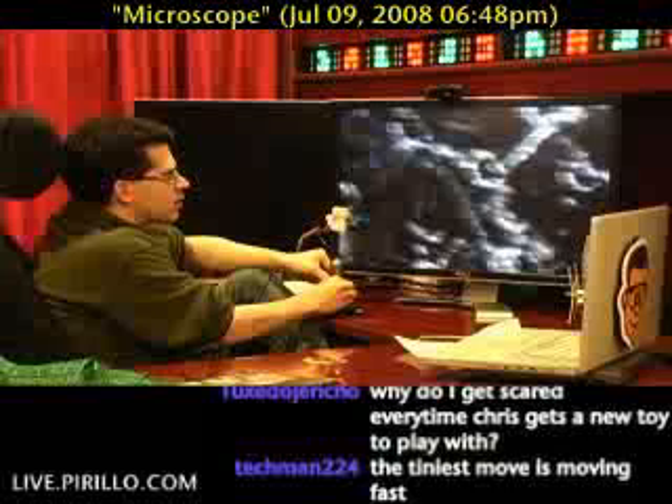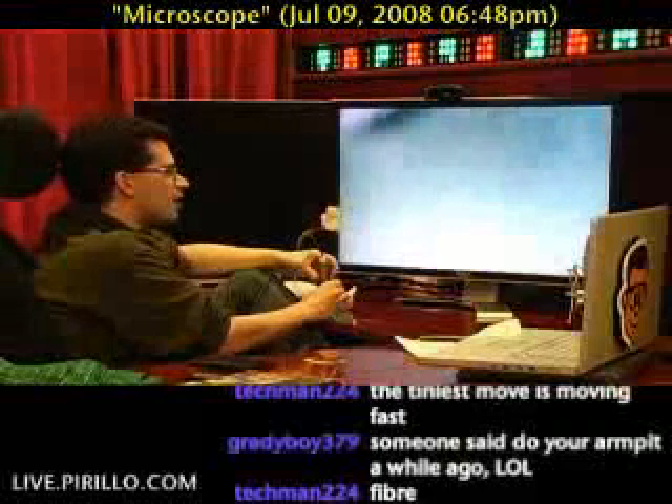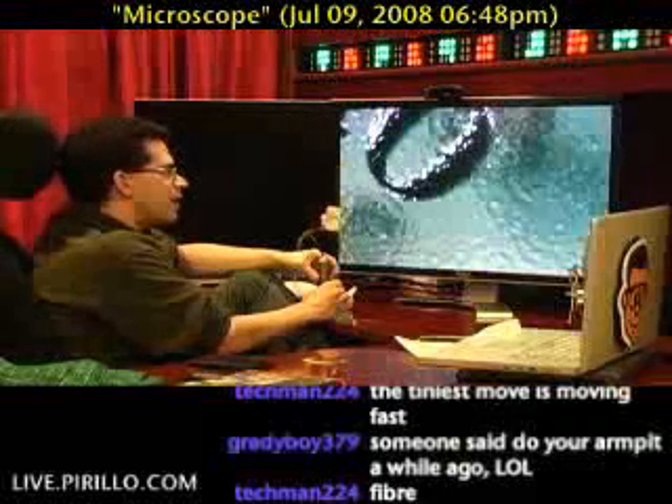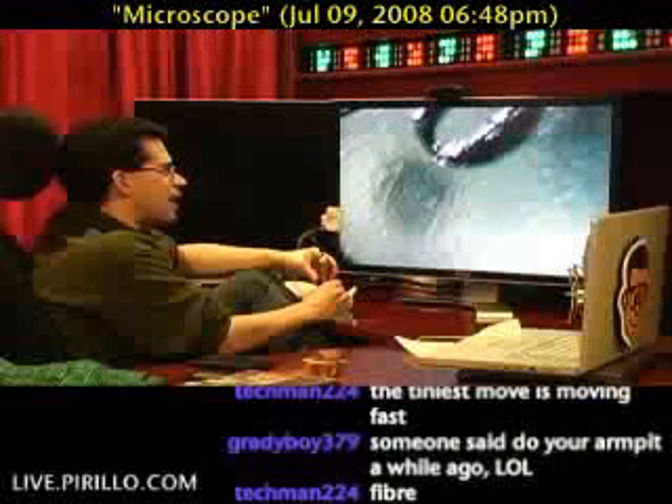I haven't tried this one yet — this is just a Purell hand sanitizer. I thought it would be interesting to try to get the bubbles. If I can get the magnification right... maybe a little too close, let me go out a little bit. Nice and disgusting. Look at that — it's kind of fun, though. Got to admit. This, I know, is cool.